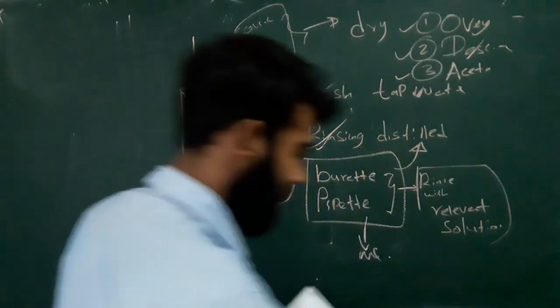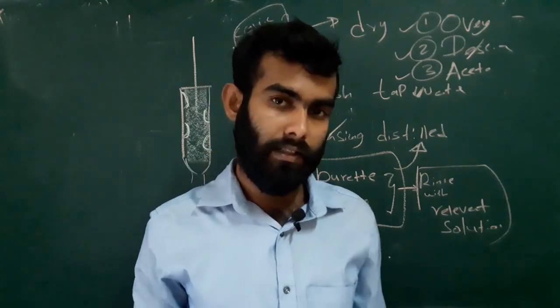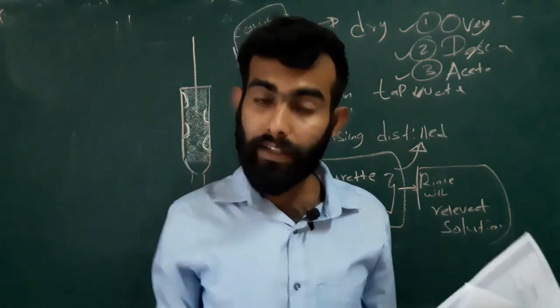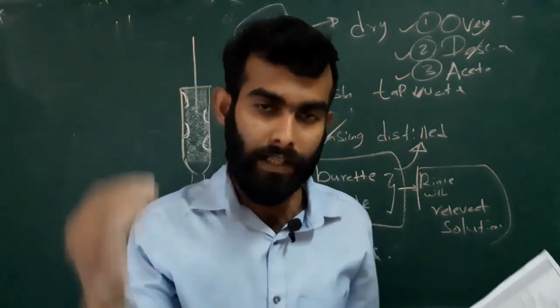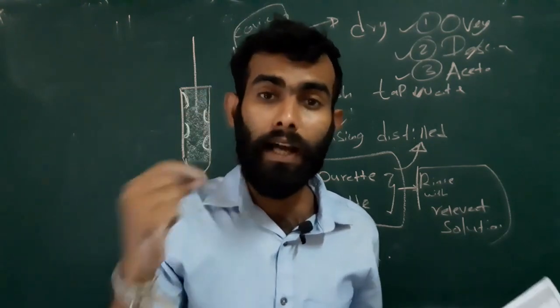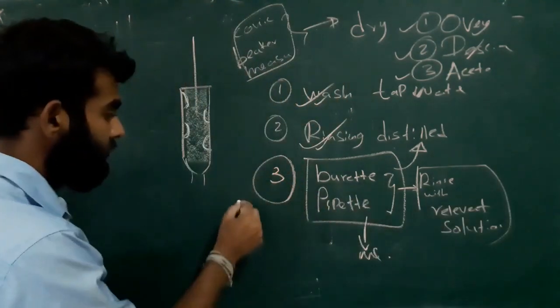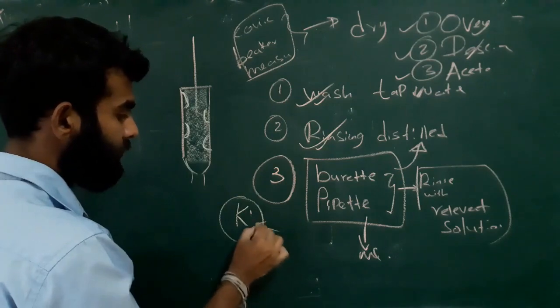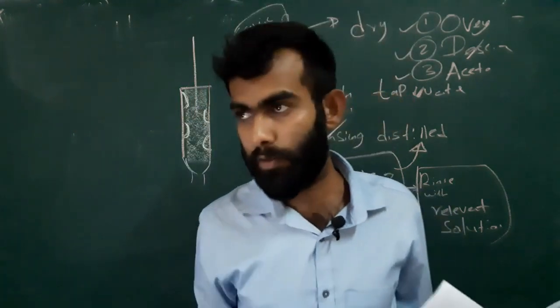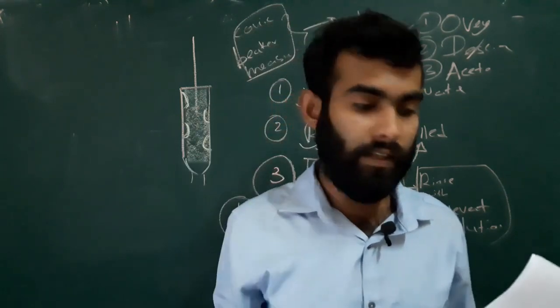Okay. Now there are some other things also. We have to care about the draining time also. So we have to use an ice bath or water bath which contains ice to maintain 20 degrees Celsius, because we are talking about kinetics. අපි චාලක රසායන ගැන කතා කරන්නේ kinetic, this K reaction, this K values or rate constants will depend on the temperature නේ. Rate constant උෂ්ණත්වය මත රඳා පවතින හින්දා we have to maintain the temperature at 20 degrees.